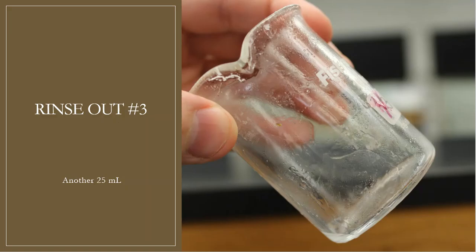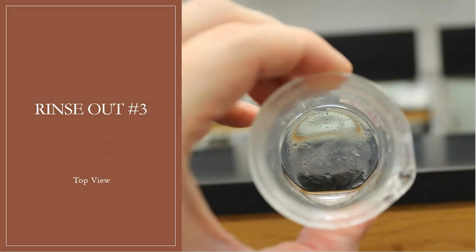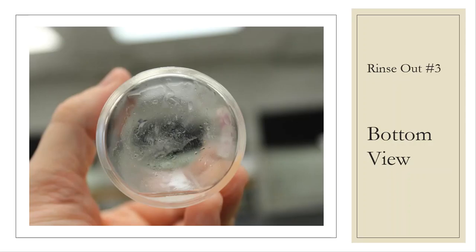So I'm going to go in and I'm going to try to get some more of that crystal residue out of there. I'm going to use another 25 milliliters of ice cold methanol, and then I add it to that beaker. I rinse and I dump. And when I dump, this is what I see left over in that beaker. So it's much better than what it was before, as you can immediately tell. I feel really good about the transfer after that point, so I do not worry with any kind of small remnant that's left over behind.